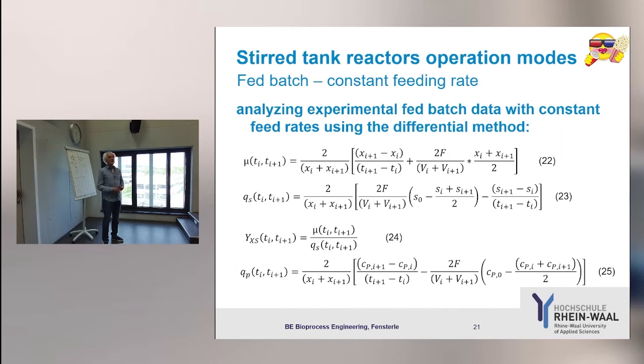So with an indefinite amount of sampling, you just have an empty reactor. But there is another point also. I just wanted to ask, the sample volume can be very small, can't we neglect this change in volume? Yeah, it depends. In a large-scale industrial bioreactor with 20,000 liters, yes. But you will need to take a sample of 1 or 2 milliliters. You need to wash tubings and so on. And if we have a 500 milliliter bioreactor and we take a sample every 2 minutes, this adds up.